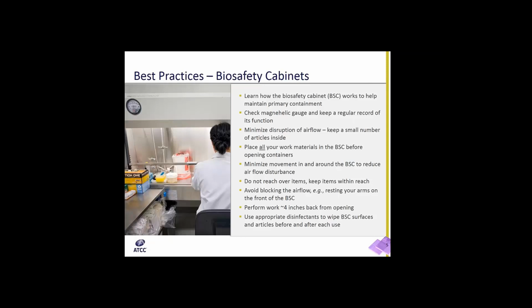This is because the Class 2 cabinets, which are commonly used, generally have requirements for protection of the product, the personnel, and the environment through the use of laminar airflow and HEPA filtration. So when you disturb the airflow, you will be compromising on containment. Most BSCs that we use in the lab have a front access opening that carefully maintains the inward flow.